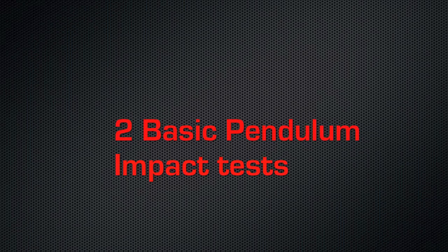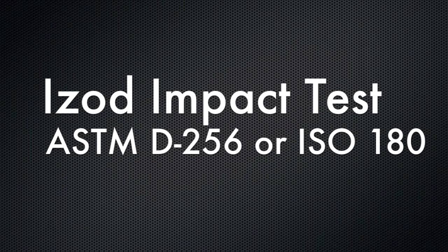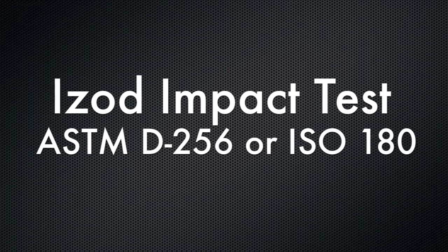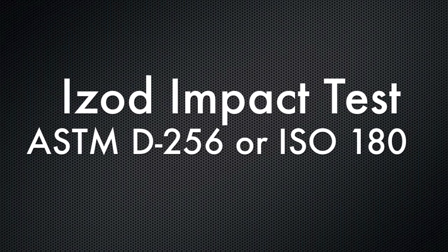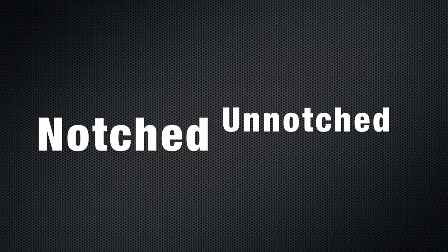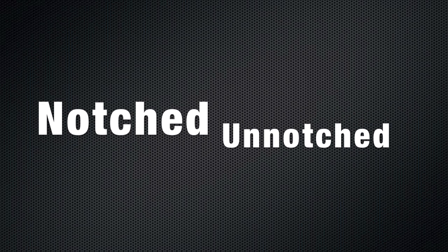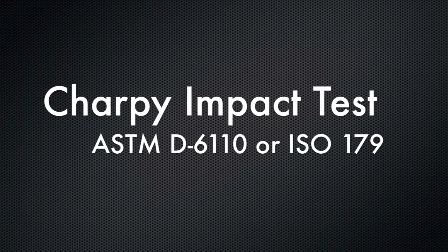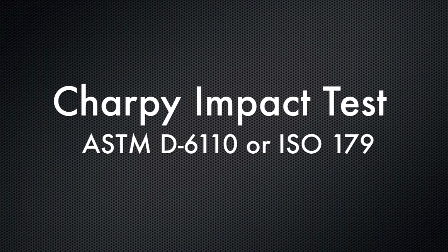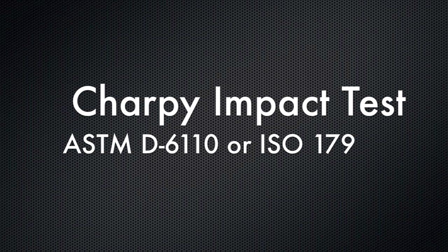In this video, we'll be covering two basic pendulum impact tests, the ASTM D256 ISO 180 equivalent, which is also known as the Izod impact test. This test has two variations, one using a notched test specimen and the other using an unnotched test specimen. The other test we will talk about in this video is the ASTM D6110 ISO 179 equivalent Charpy impact test.